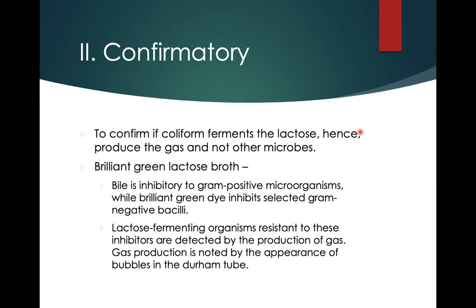Next, we have the confirmatory test. We do this to confirm whether what we initially identified as coliform really ferments lactose, because coliforms are lactose fermenters and they produce gas from it. What we use is brilliant green lactose bile broth. The contents of this medium facilitate our confirmatory test.